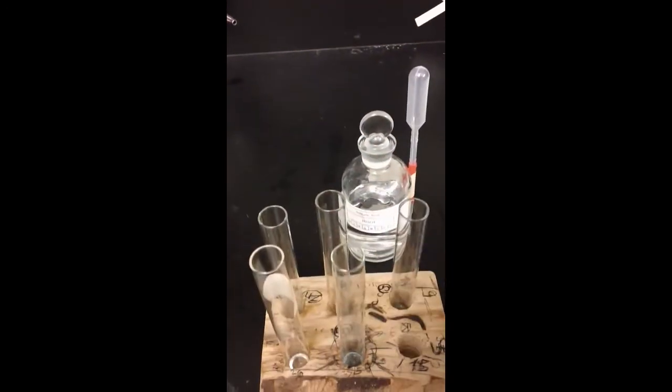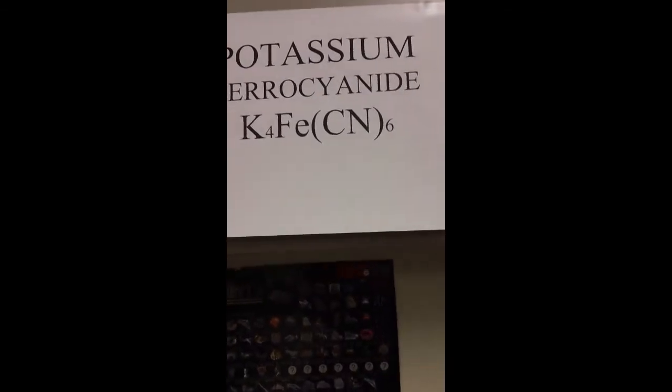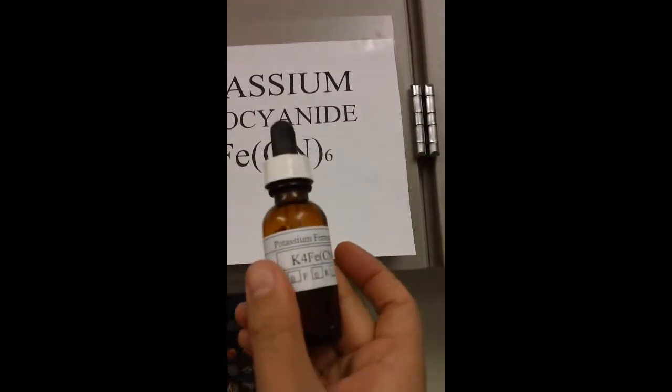All right, so now I need to add 5 drops of K4FeCN6 and then centrifuge. So I'm gonna go over here, check my sign, check my bottle, same thing, okay? So now I'm gonna be adding into here. I'm gonna come back with the video once everything is added and we'll record our observations.